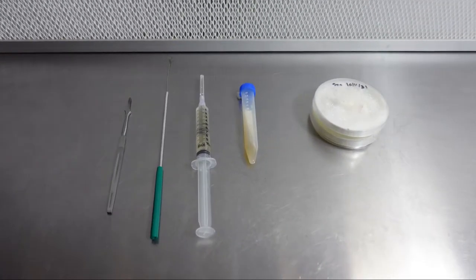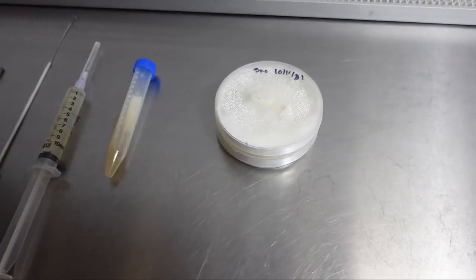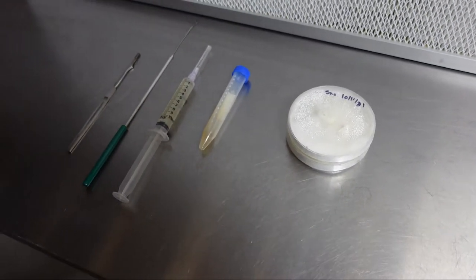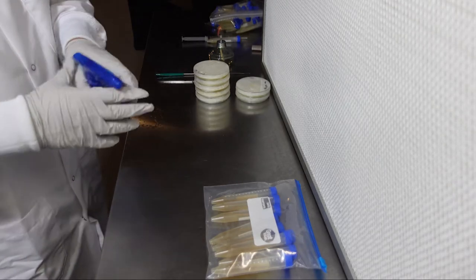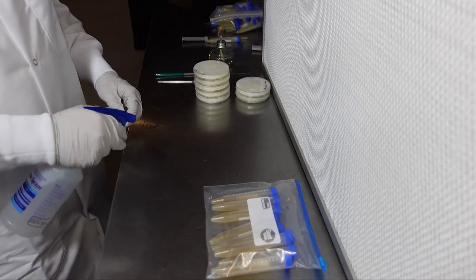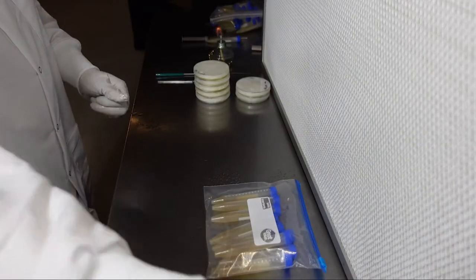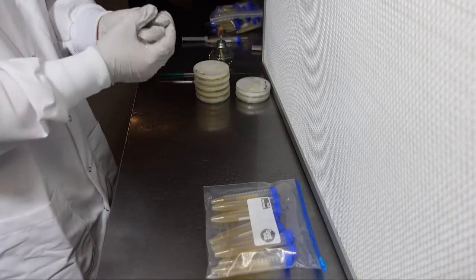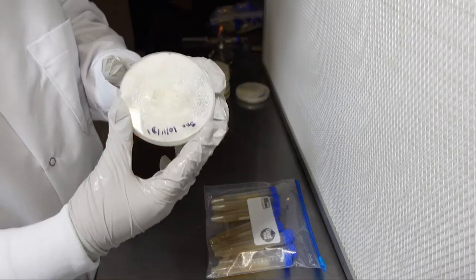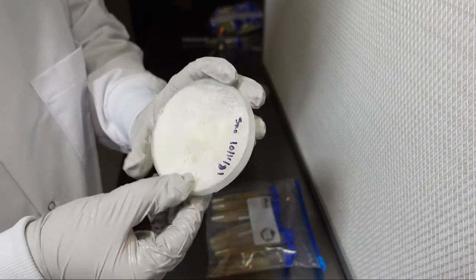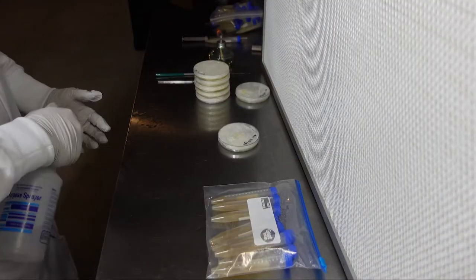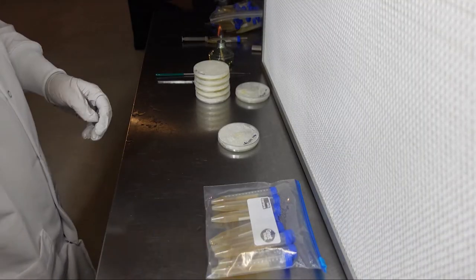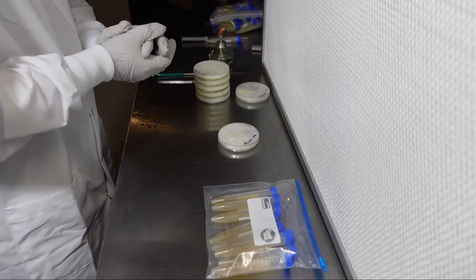Now I'll demonstrate how to inoculate your agar slants with liquid culture and with plate cultures using an inoculation loop and using a scalpel. For these transfers you'll need to be working in a sterile environment. Here I'm working in front of a laminar flow hood but you can optionally use a still air box. Before you start, spray everything down with isopropyl alcohol to sterilize it.